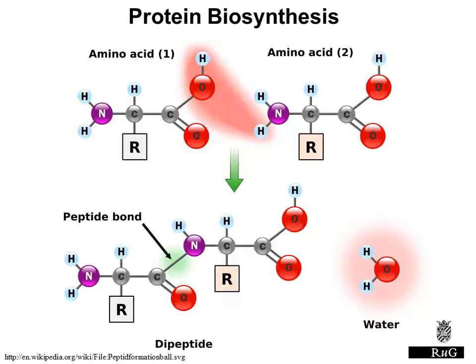The place where the number of negative charges is exactly equal to the number of positive charges is called the isoelectric point of the protein. It is this isoelectric point that the protein tries to reach in isoelectric focusing.